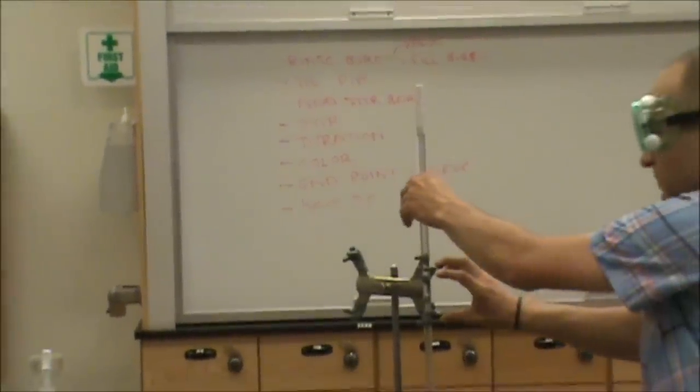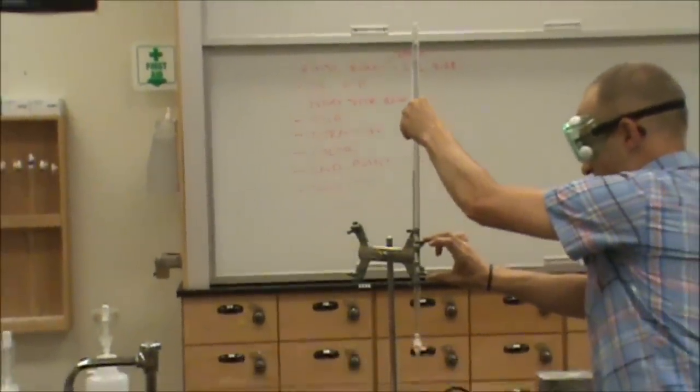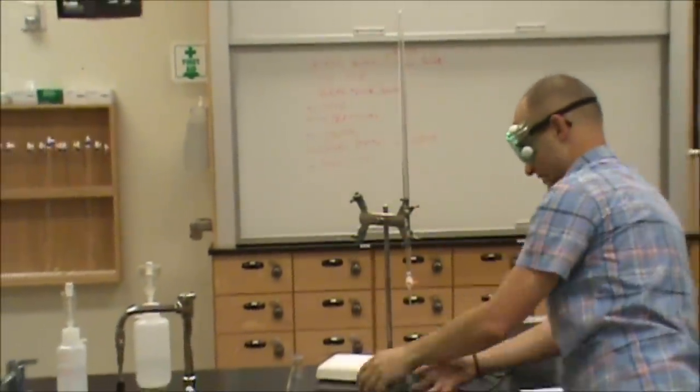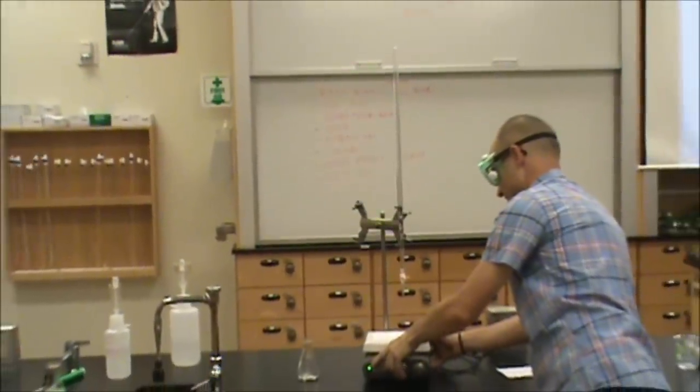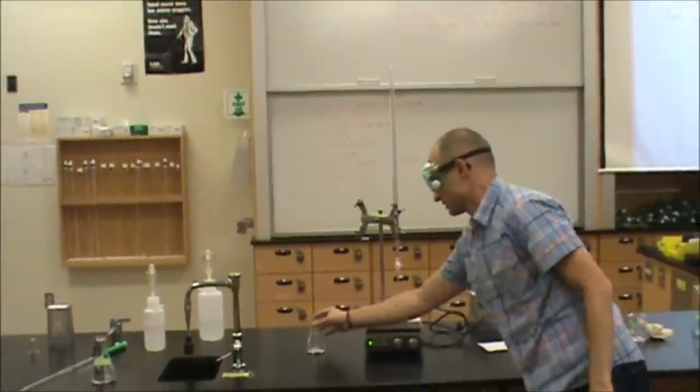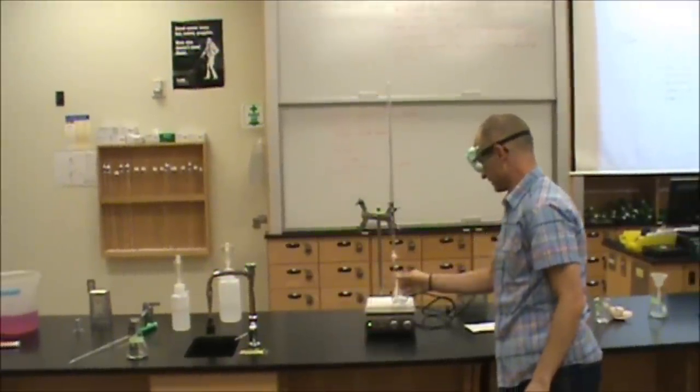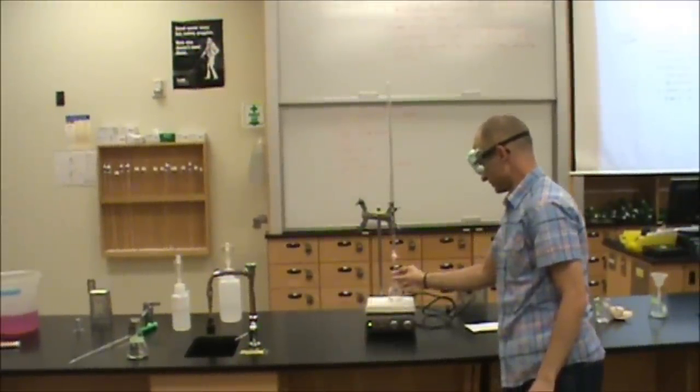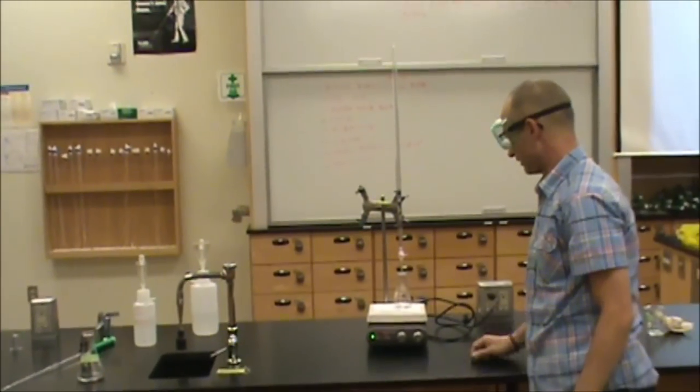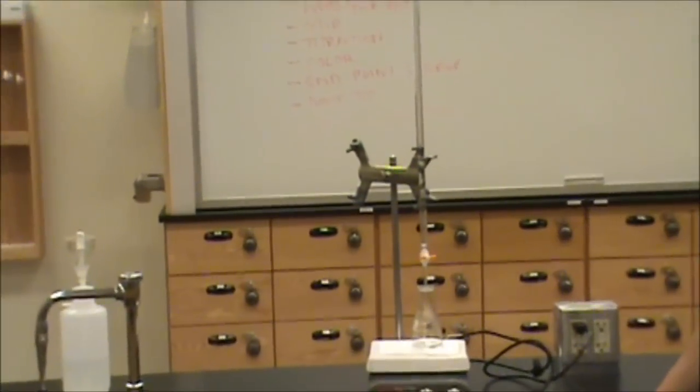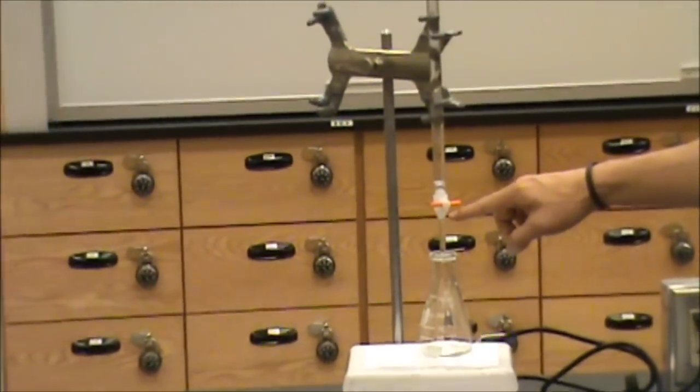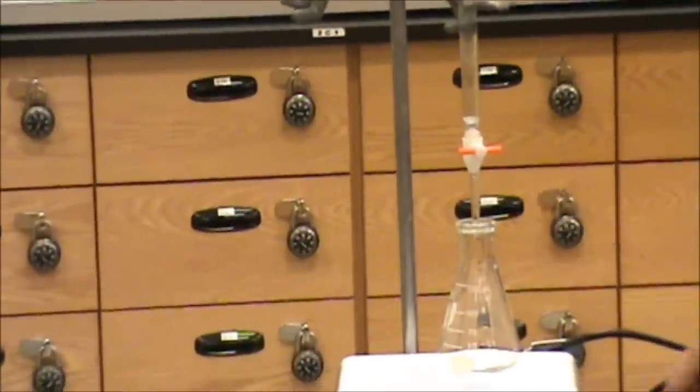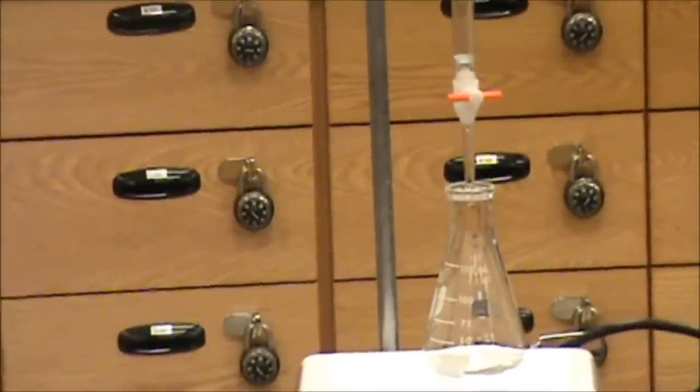With our initial volume recorded, I'm going to slide our burette back up, replace our magnetic stir plate, add our container of analyte. And I find it best if the tip of the burette is just below the lip of our container to help reduce the chance of spillage or splashing.